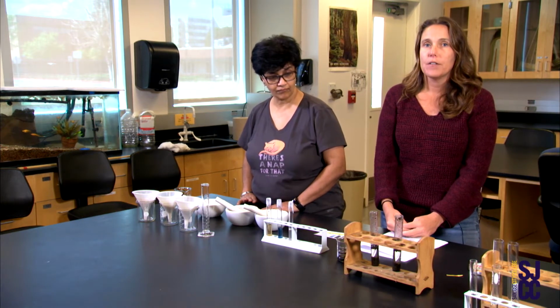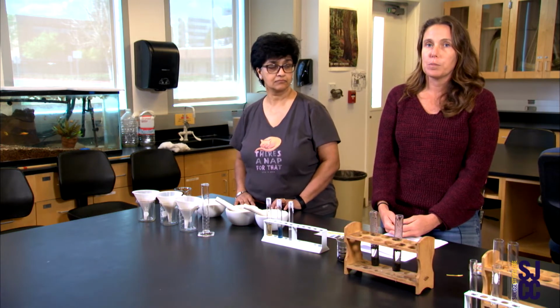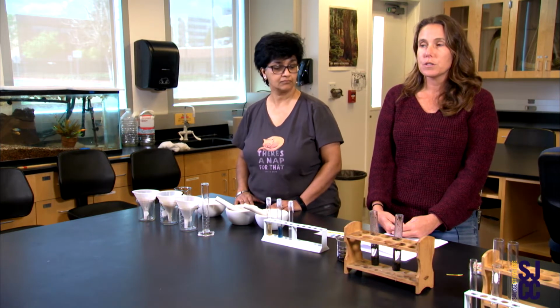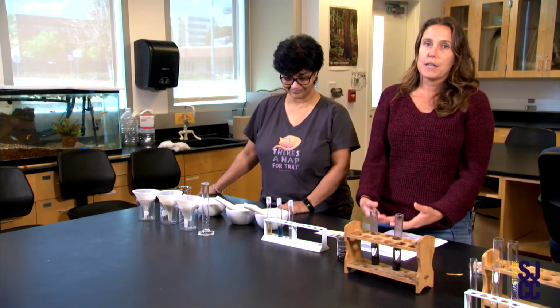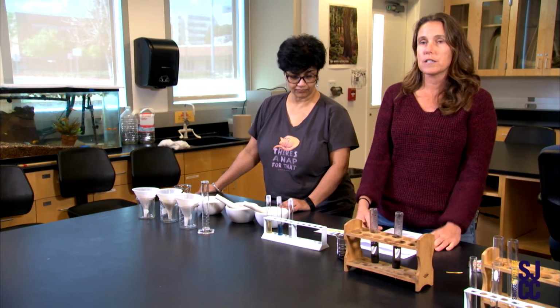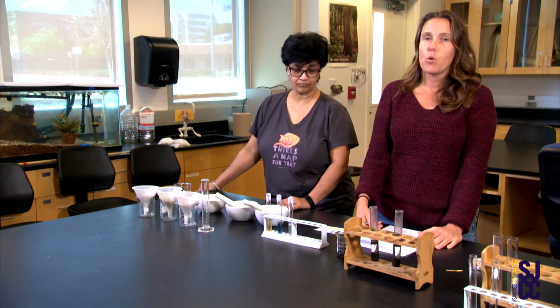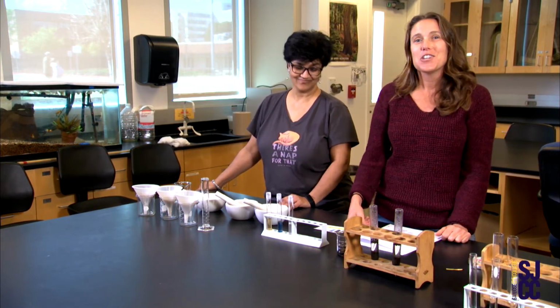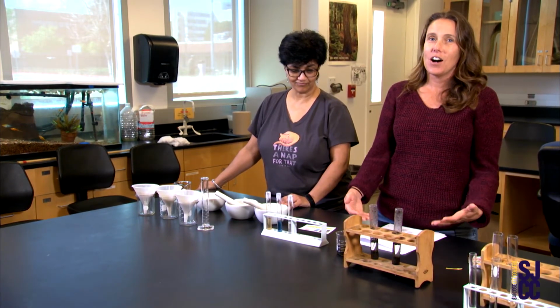We also have phosphorus. Phosphorus is another important element that is needed for plant growth, especially in root protection and development of flowers and fruits. And then lastly, our other important macronutrient is potassium. Again, it's really essential for absorbing minerals and nutrients, and again, root growth and stability. And so we looked at these 3 important macronutrients, and I wish you were here because this is a lot of fun to do. You extract it and you have an interpretation of a color as an indicator of these 3 essential macronutrients.